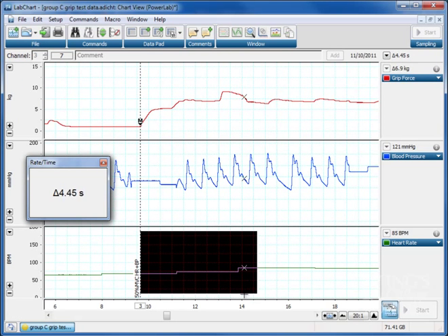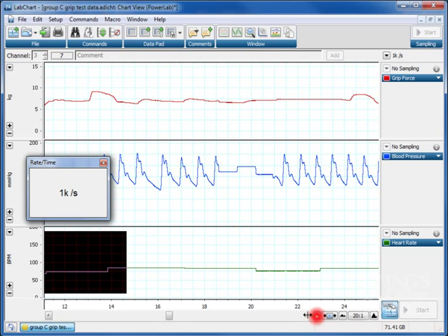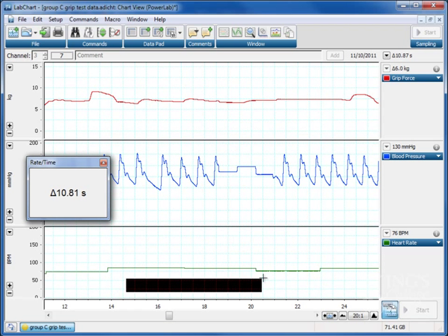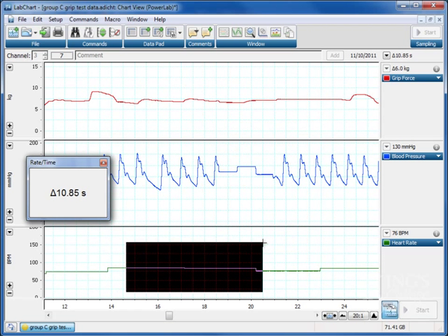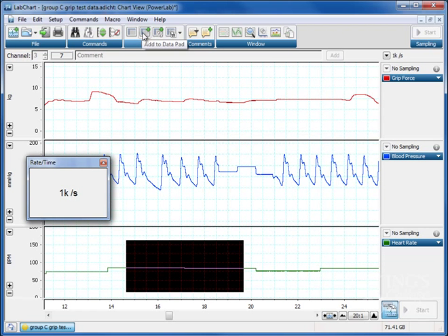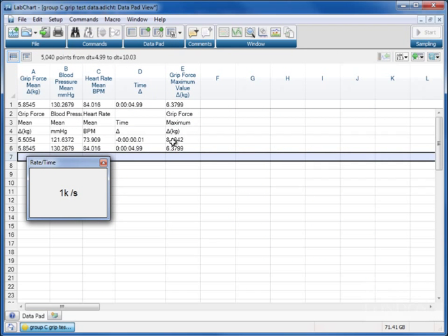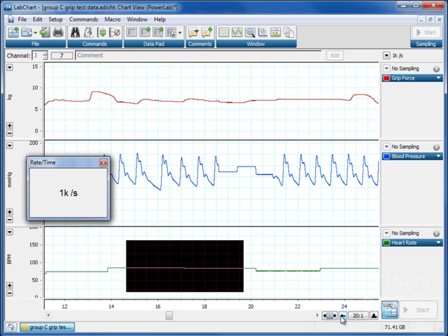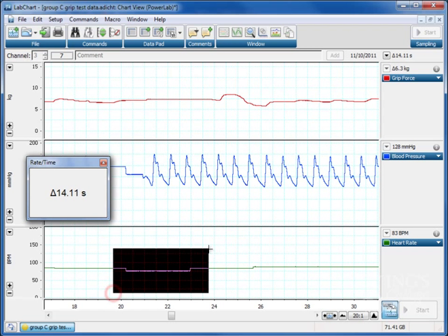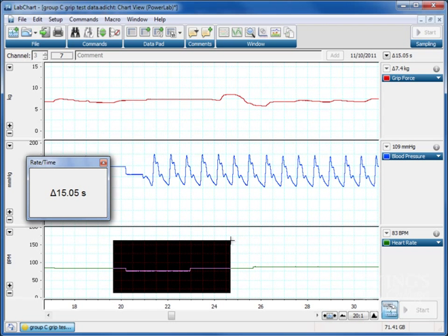So back to our chart view. Now we can choose the next five seconds. So we've got 4.99 to 10.03. That's good enough. And we'll press add to data pad. Just to check, we've now got two data sets. OK. From zero and five seconds. Let's go back to our chart view and let's select the next five seconds. So we select from 10 through to 15. Add that to our data pad.